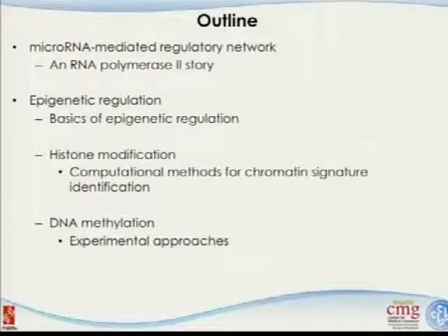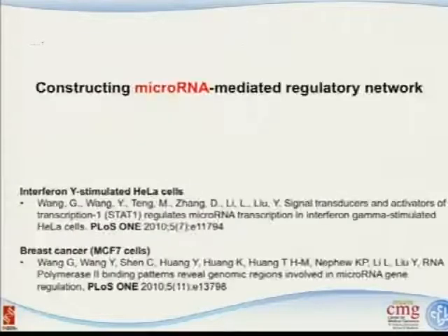I also asked my colleagues from Ohio State, two professors there, and they didn't even know about this one. So you can see that this is still a research area, and the computational part is yet to be discovered. For DNA methylation, there are even fewer analysis tools, but I'm going to tell you about several different experimental approaches using next-generation sequencing. Basically, this will be focused on the experimental part.